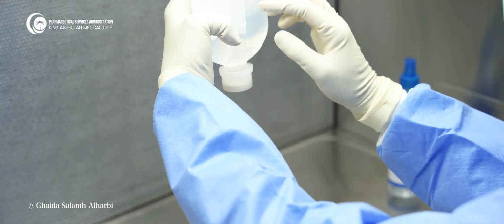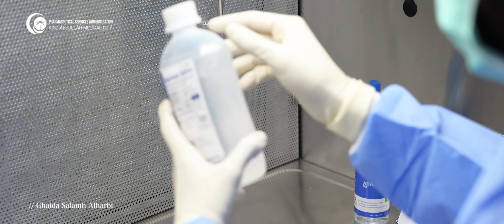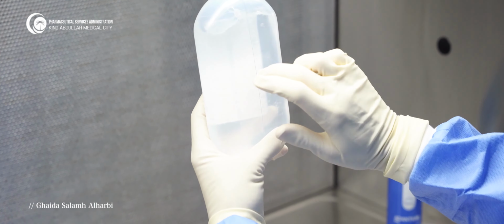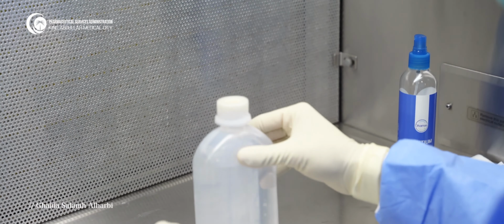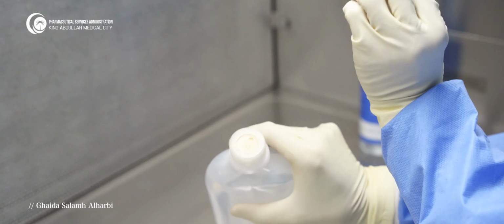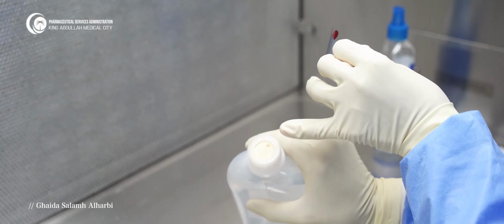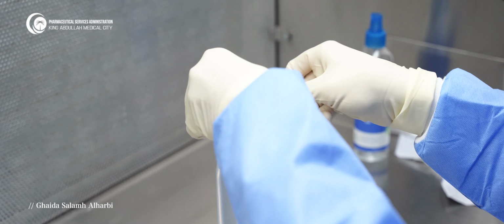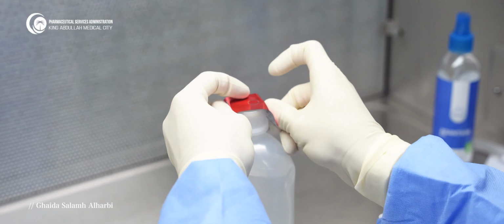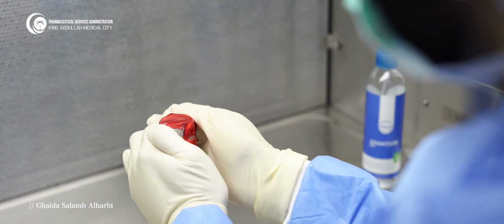After the preparation, we will check if there is any rubber that went inside. Make visual inspection. Then we will cover the critical part with the seal inside the hood. See, the circle inside the seal will be over the administration port.